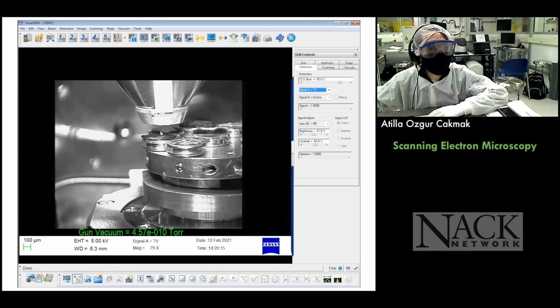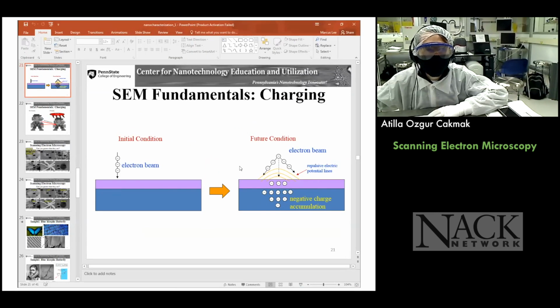And one of the questions was, how can we enhance the contrast, the quality of the image? Now, a lot of these samples that are placed here are biological samples, like the first one we're looking into, the butterfly wing. You have to coat them with a thin layer of gold, a good conductor, to make sure that the electrons won't be trapped. So this is kind of what I mean very quickly. All right, this is from another presentation, just to give you an idea.